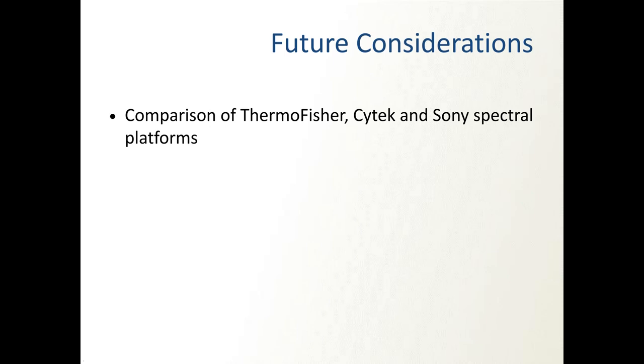And the amount of effort and resources it takes to be able to compare these things is really limiting. There's not that many places that have more than one of each of those three systems, let alone three of them. So the idea of a great cross comparison where we can do one experiment and look at it in all three platforms and then debate the nuances in the unmixing algorithms, that's where we're going to be going forward. This is a really, really complex space, and we've only looked through it through one lens until now. Now that we're looking through the second lens, it's opening up a lot of questions.